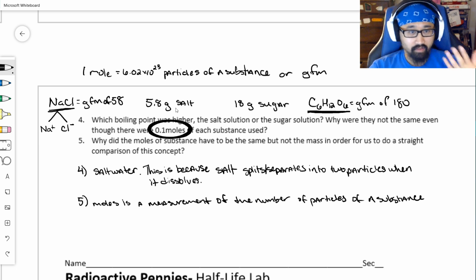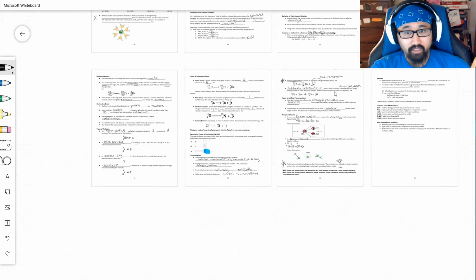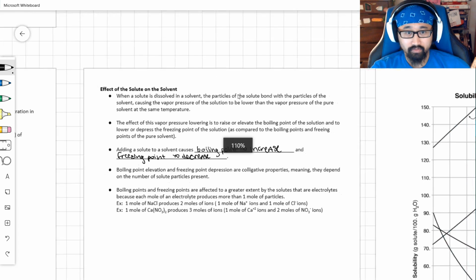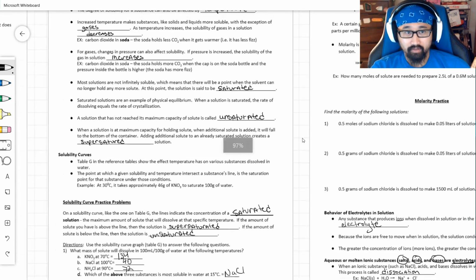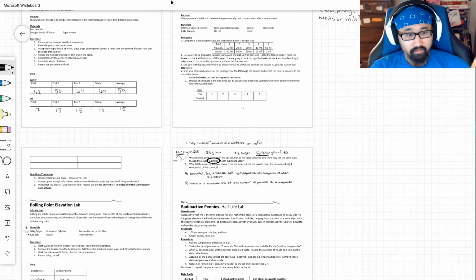And again, this goes back to the notes, which if you're in class, we will talk more about on Monday. If you're fully remote, you might have already checked out the notes here. This is this part. When a solute is dissolved in a solvent, the particles of the solute have an effect. It's about how many particles there are. It's not about the mass of the particles. So that's why we needed the number of moles to be the same. Anyway, this lab, the boiling point elevation lab.